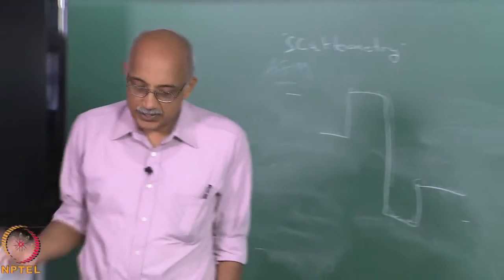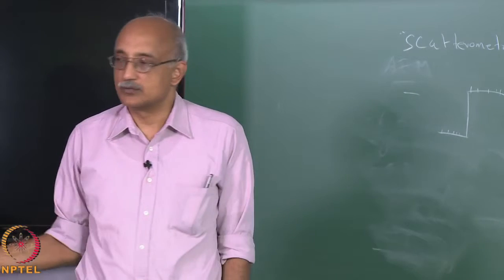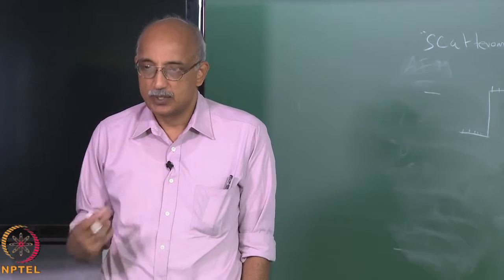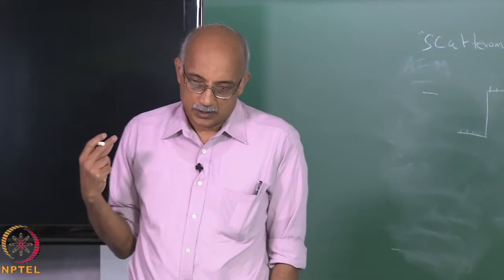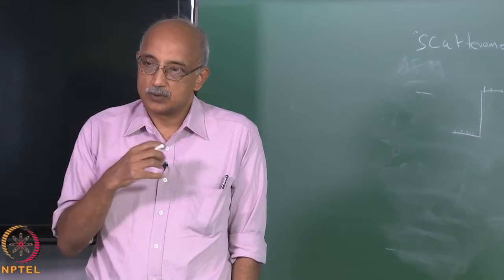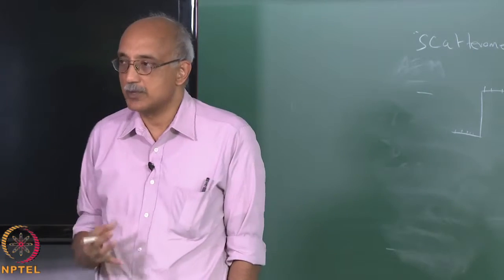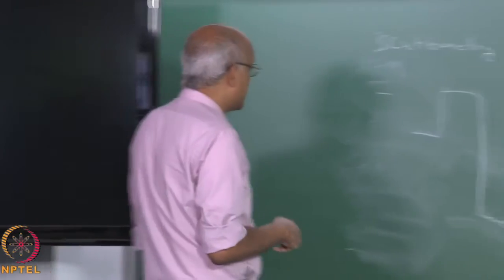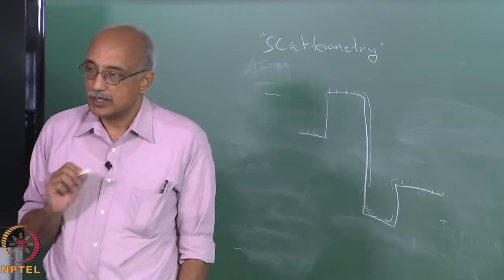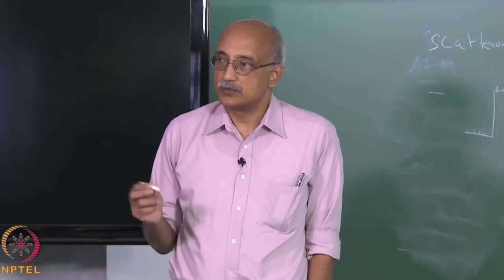Where, as the name suggests, it basically looks at scattered light. And the idea is quite simple. You just essentially scan your surface with laser light and you look at the scattered light through image capture. So you have some sensitive CCD type of cameras set up, along with a photometer, so that it can capture the scattered light and then convert it to a series of images. So here, what will happen is that as you traverse this light through here, when you have a film on a surface, you will get a very different light scattering signal compared to when you don't have a film.